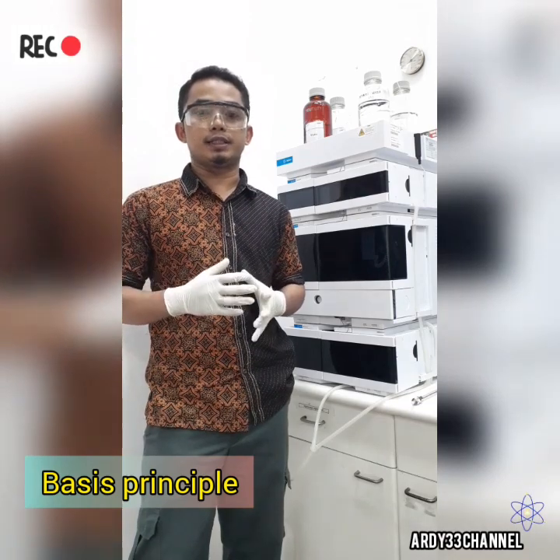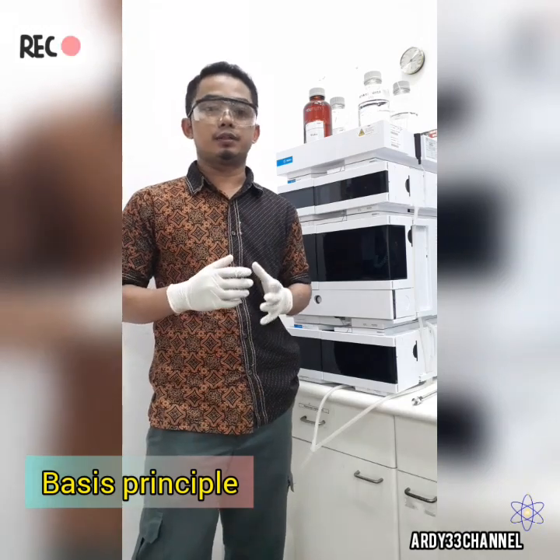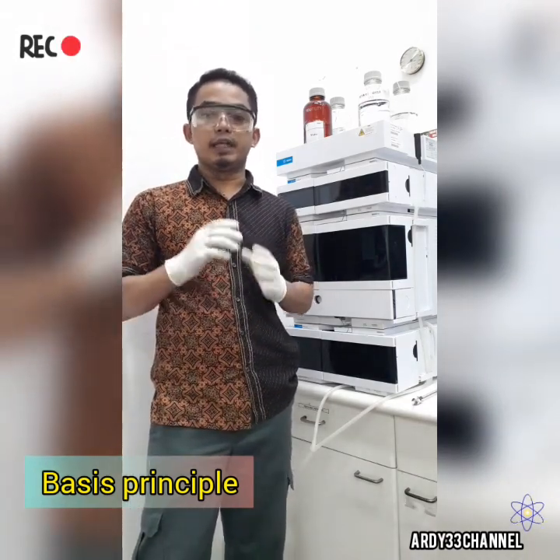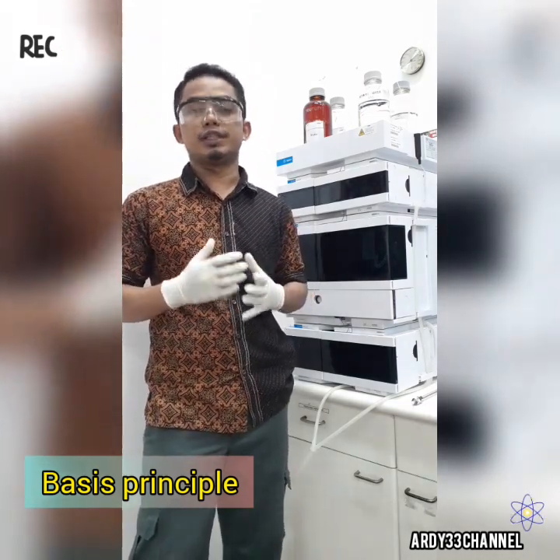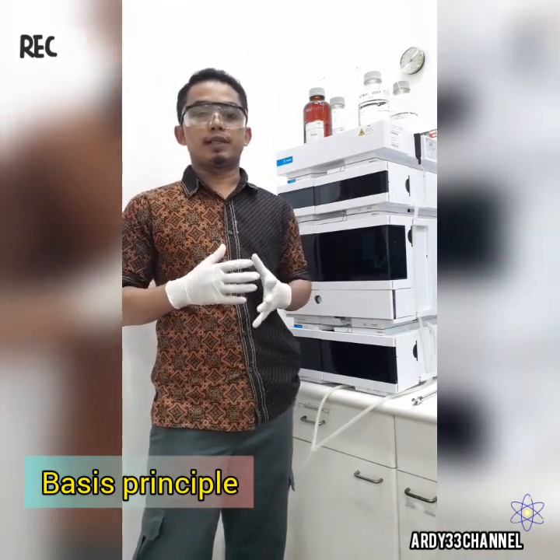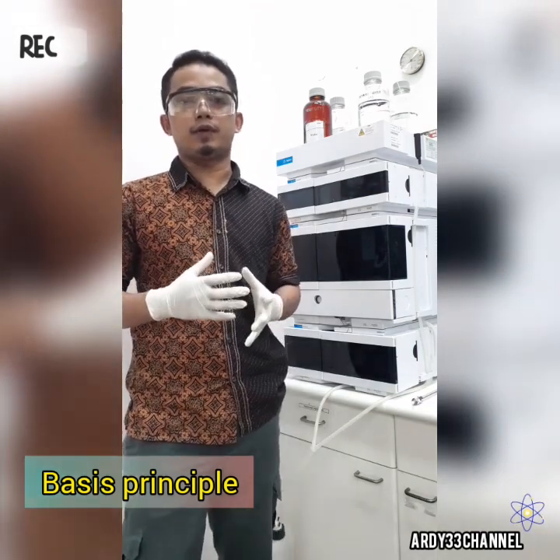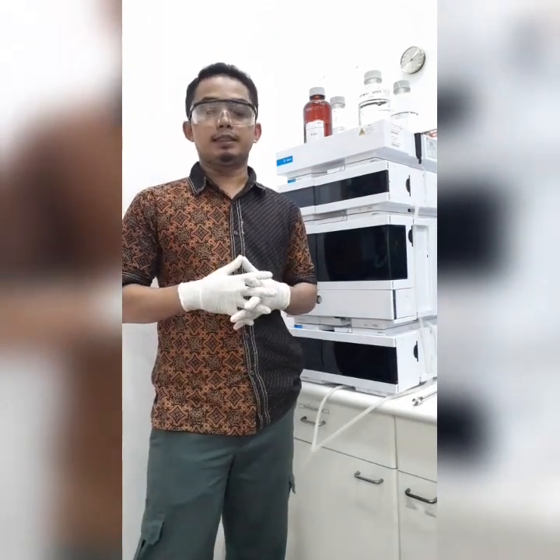In general, an HPLC system contains the following modules: solvent reservoir, a pump, injection valve, a column, detector unit, and processing unit. The solvent or eluent is delivered by the pump at high pressure and constant speed to the system. To keep the drift and noise of the detector signal as low as possible, a constant and continuous flow from the pump is crucial. The analyte or sample is provided to the eluent by the injection valve. This is the principle of the HPLC system.